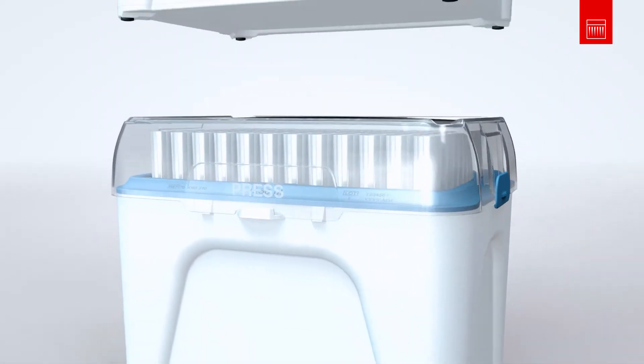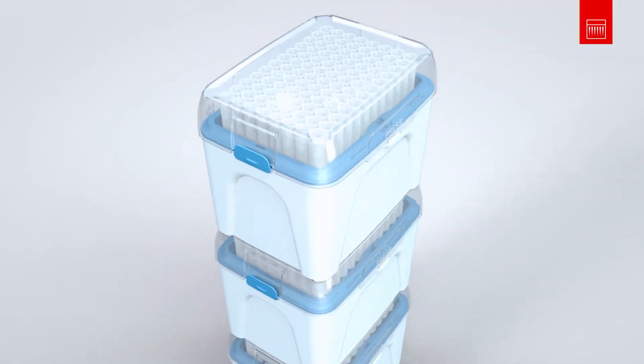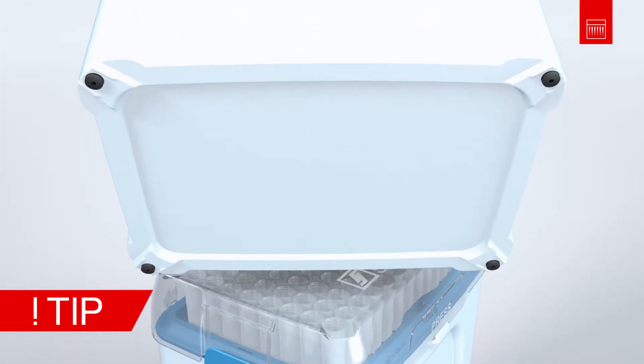The box can be securely stacked in any working area, even if storage space is limited. Did you know that the optional feet provide additional hold on particularly smooth surfaces?